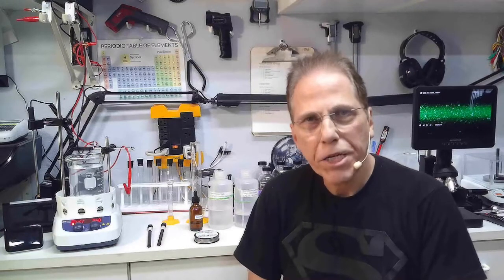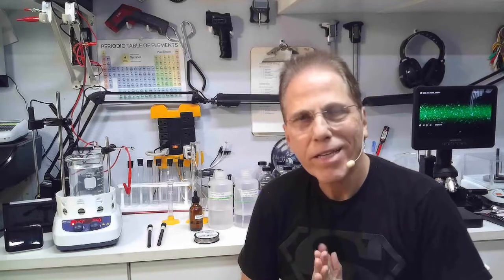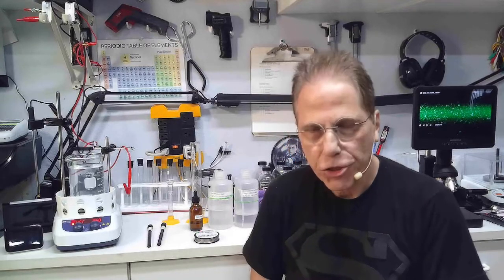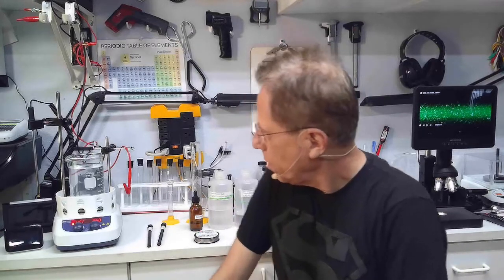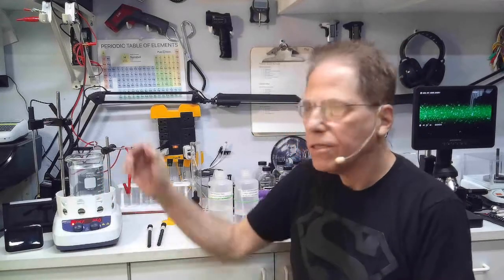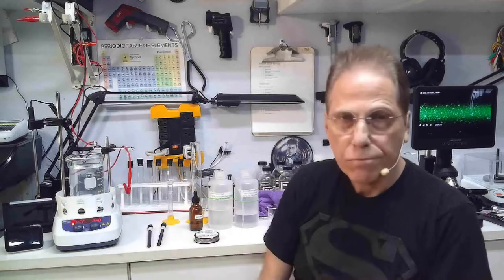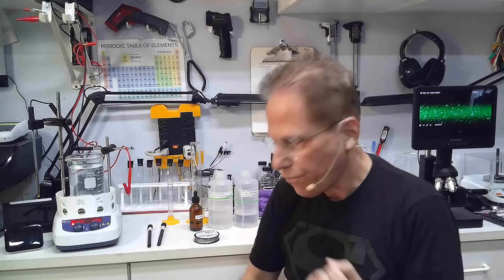Welcome to Reality Creative Video. I'm Hermes, and today we're going to cover how to make titanium from start to finish. Here we have a beaker — 500 milliliters of titanium — and I've already cooked it, but we're going to go through how to make it now.